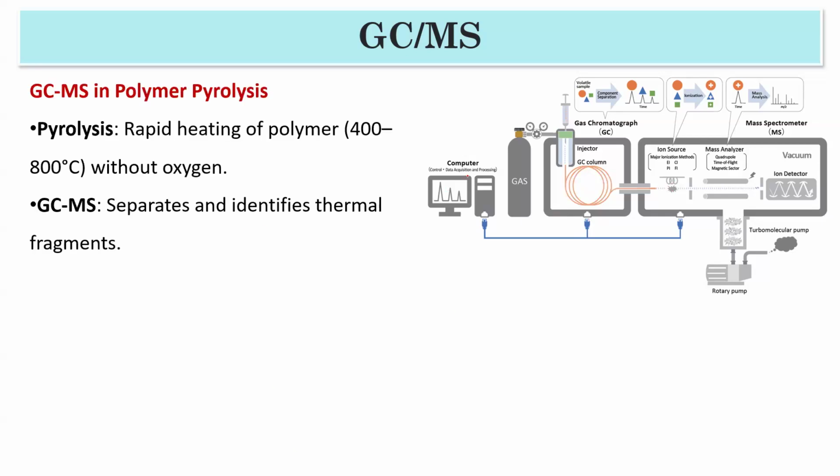So I want to say that GC is good for small molecules. You should not do it for polymers, because they will not move inside. It will be very difficult to move them. So you can mostly use it for small molecules, which have a low boiling point. One thing you will see is that people also analyze polymers.